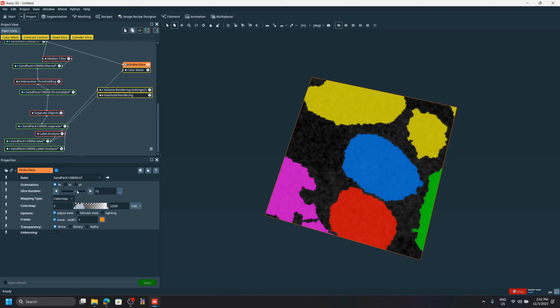And since you mentioned that, it's very important to know that after doing the segmentation process, most likely you will not get a perfect result, right? So you'll probably have to do some fixing, which is sometimes called proofreading, right? So you'll have to do maybe a little bit of manual work. But the goal of using segmentation tools, especially the AI tools, is to reduce the manual work, right?